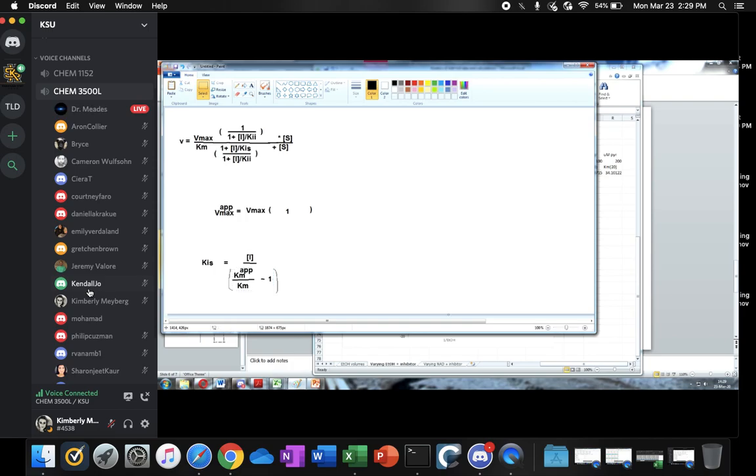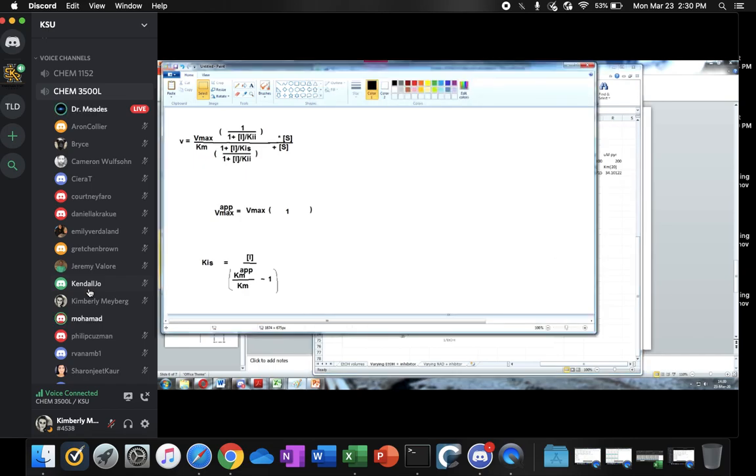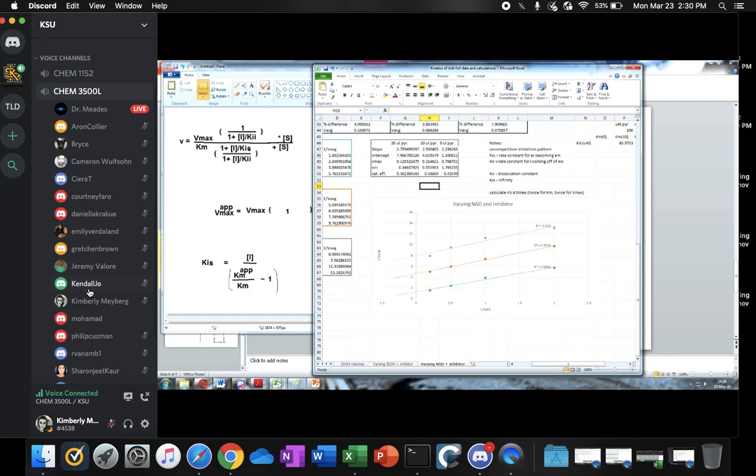All right, so I got 17.46 or so. I could do the same equation again because you did another amount of inhibitor using 200, and I get something like 34. That one's not as good looking as the other one. But I can calculate those, and I'll just take an average of those. Those don't look very good, but we'll take them. Okay. I want you to do the same analysis for uncompetitive, which was these data.